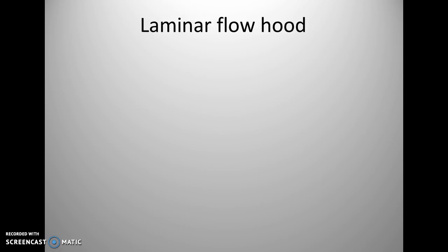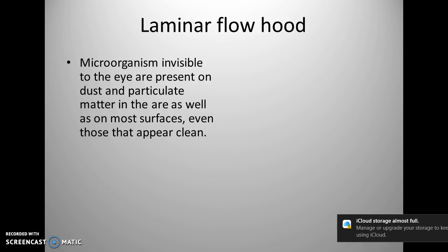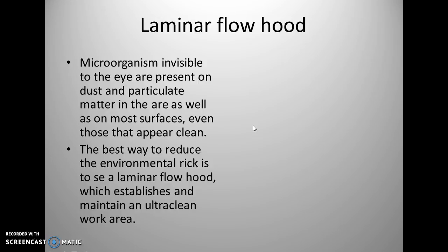Let's move from that into now some of the preparation areas for the pharmacy technician, and this can be within the laminar flow hood. So microorganisms, you must note, are invisible to the eye. They can be on particulates, they could be on dust, and basically on most surface areas, even though it may appear clean. Okay, so it's very important that again you have a clean work area.